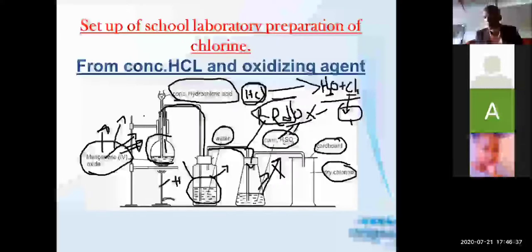Are we together? Anhydrous calcium chloride. So when you are using the solid drying agent, this is what you have to know: the drying agent must be put in a U-tube.